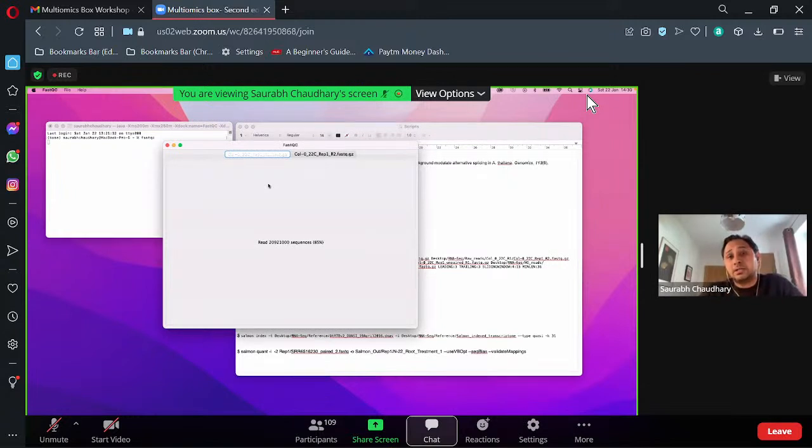You can use the STAR aligner, and it will give you almost the same result. But in the STAR aligner, there is a two-step procedure: you first have to perform the mapping, and then you have to perform the quantification. With Salmon, which I'm using, it is fast and performs mapping and quantification simultaneously.